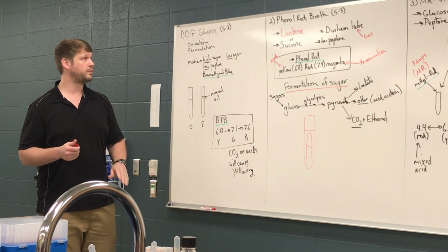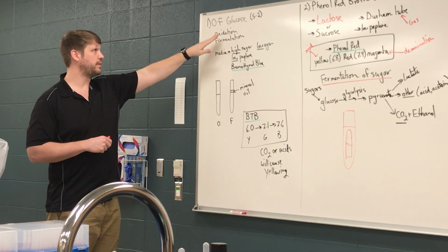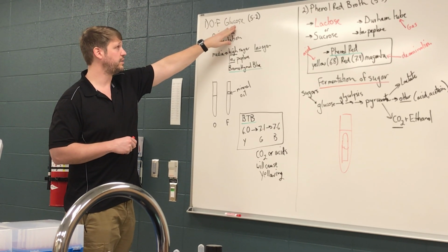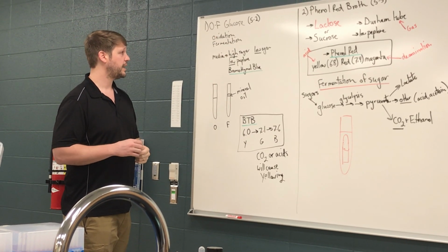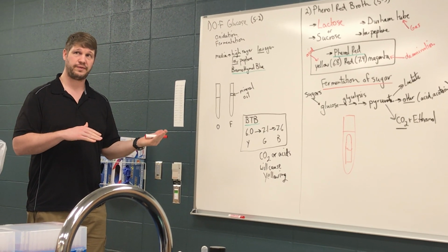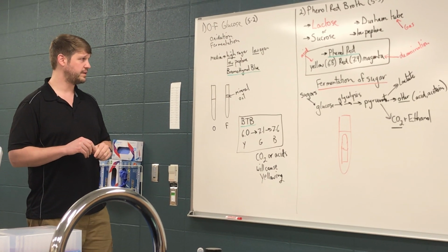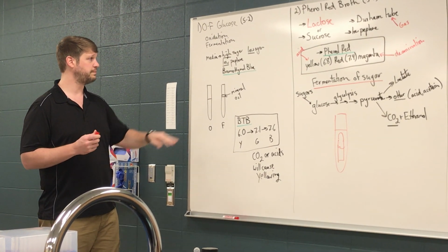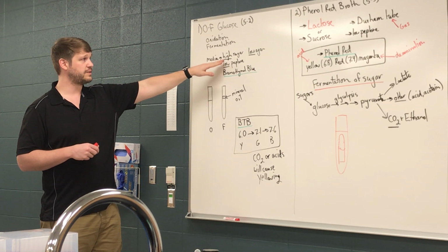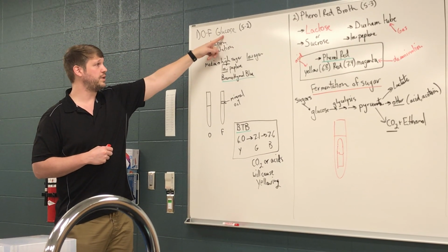All right, then moving on. The second one's very similar concept here, but we're looking at glucose specifically, and we're looking at whether organisms can oxidize and/or ferment glucose. And this is a fairly straightforward system. We have a media which has a very high sugar content. In this case, the sugar is glucose.